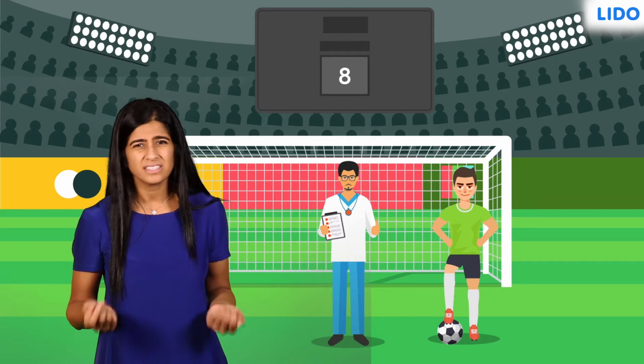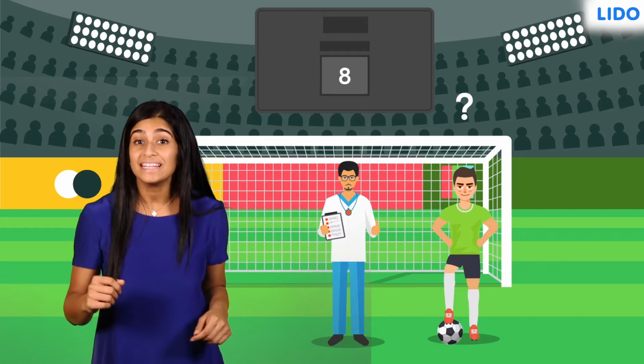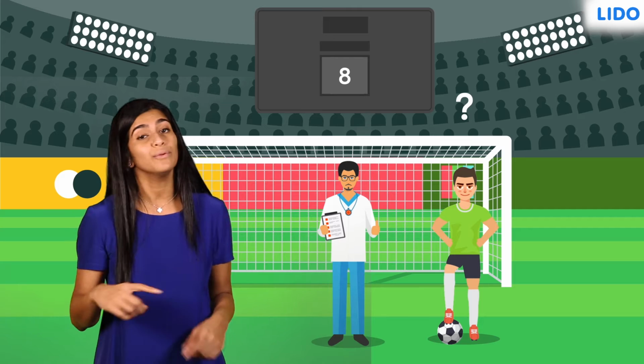But he doesn't know which food items contain these nutrients. Let's help him with a few simple tests to figure out which foods contain which nutrients.